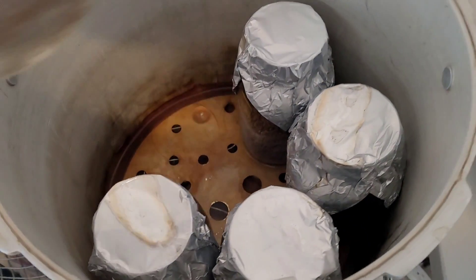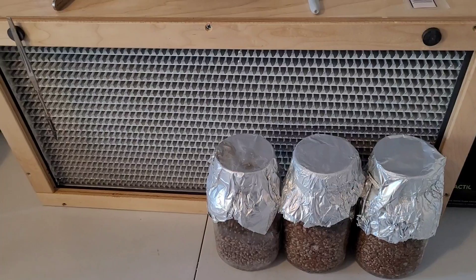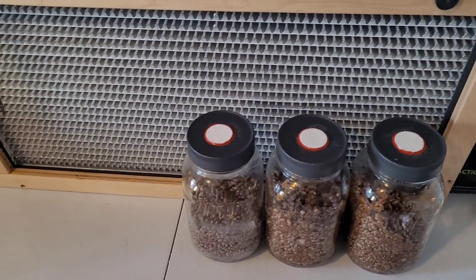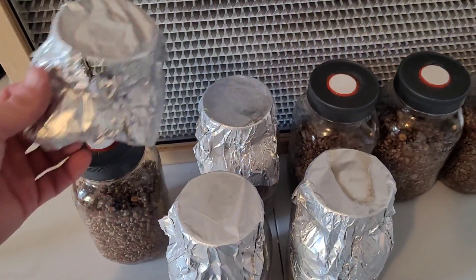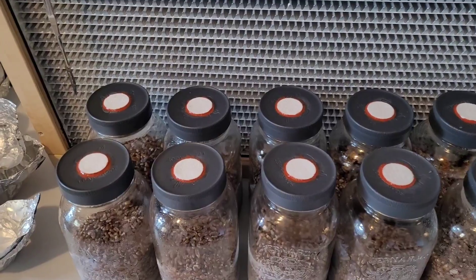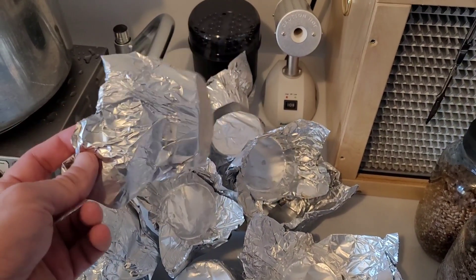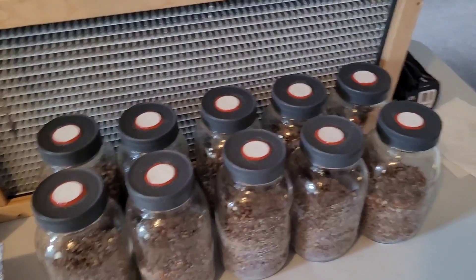The same applies post-inoculation — once you've inoculated these jars, you don't want to keep your foil caps on during the spawn run. When working in a flow hood, you can leave the caps on and take them off one at a time, or take them all off and proceed with whatever inoculum you're using. When operating in a still air box, just take them all off once you have them loaded into your box. Once all the foil caps are removed, just save them for later — throw them in a little bag and use them for the next series of runs. They last quite a while unless you tear holes in them. And that's how you prep cereal grains for grain spawn.